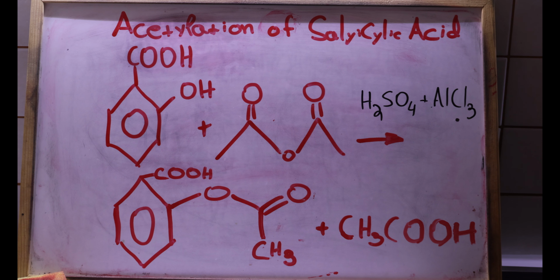Salicylic acid is derived from the bark of the willow tree and has been used as a folk remedy for many hundreds of years. However, its acetylated version is very much better tolerated by the body and is much more effective at what it does and how it does it. So we'll be making it.